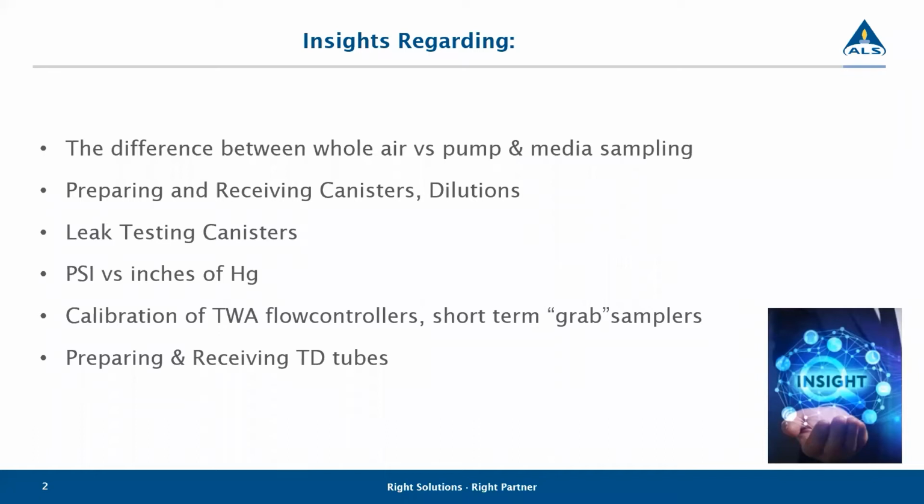So when we talk about insights regarding our canisters and TD tubes, these are things that I would say probably the vast majority of people are aware happen, but maybe aren't aware of the timelines and details, and why we ask for the things that we do, or why we insist on additional time, or try to explain different terminology. So we'll run through some of those things. Also do those related to canisters as well as thermal desorption tubes, but I do want to let you know that primarily this will be about canisters, and then I will discuss the thermal desorption tubes on the side, but they are probably a little bit more minor to the presentation.